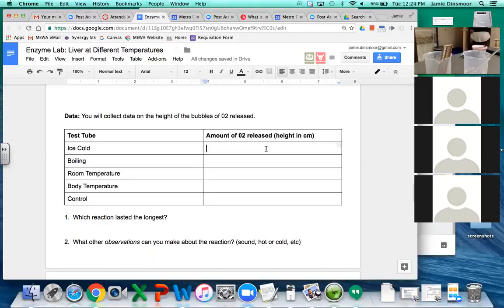So we will get a graduate. All right. I need somebody to fill this up with 5 milliliters of water. And then while we're waiting, we can have one of you guys fill these up with 5 milliliters of the hydrogen peroxide. It doesn't have a cover on it. Okay, we need rulers.